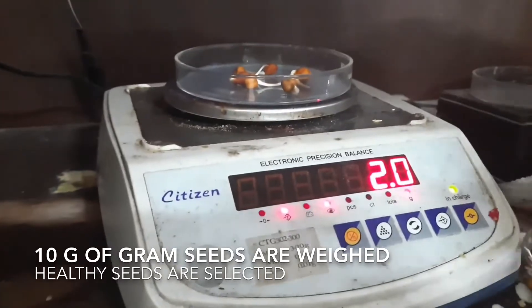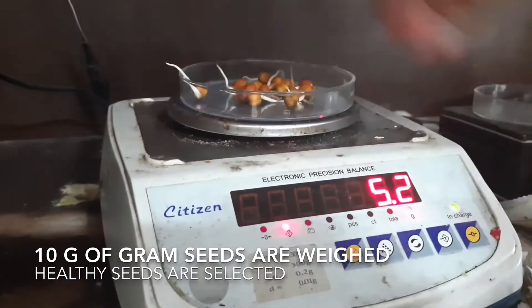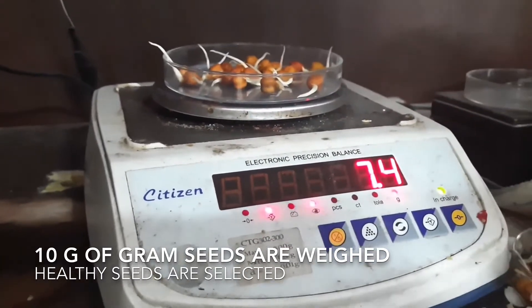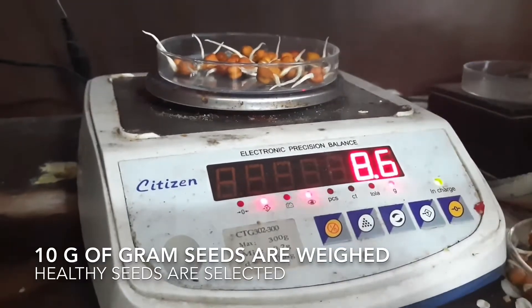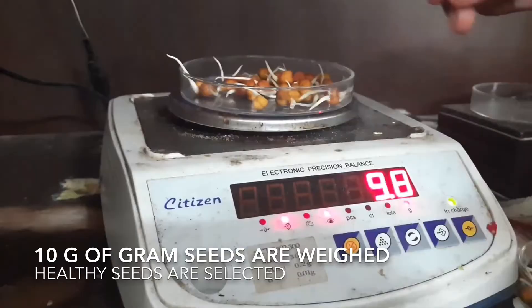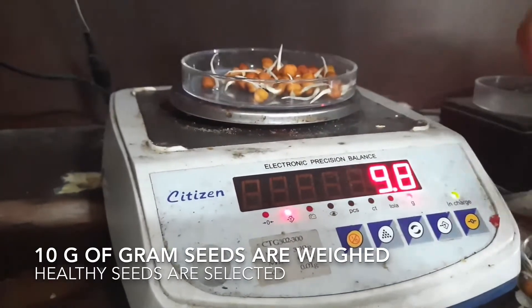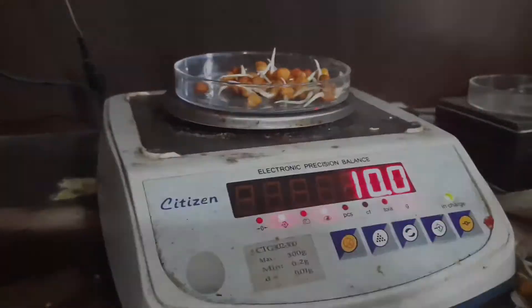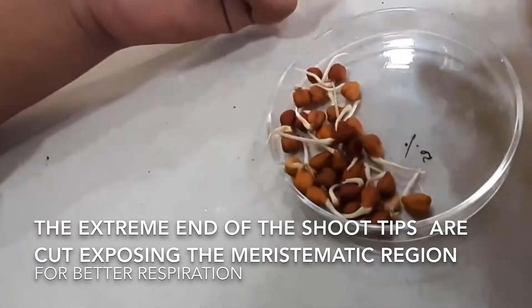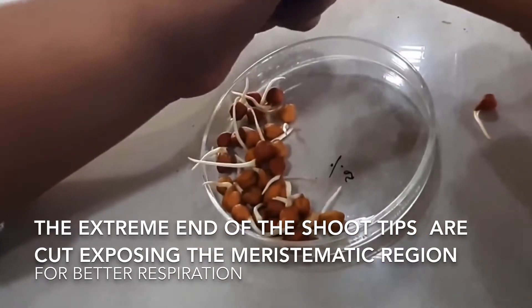10 grams of the germinating seeds are weighed in a digital balance. Make sure that we are taking healthy seeds so that we get a better result. Also, make sure the extremities of the shoot tips are cut so that the maximum number of cells are exposed for better respiration.